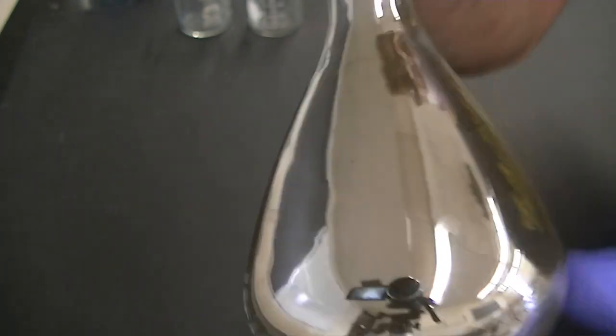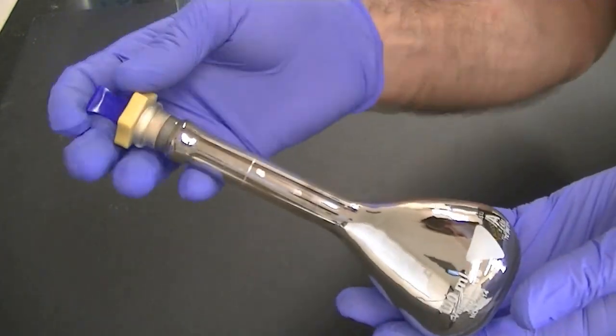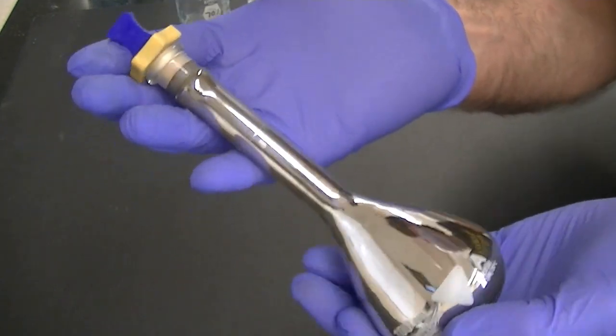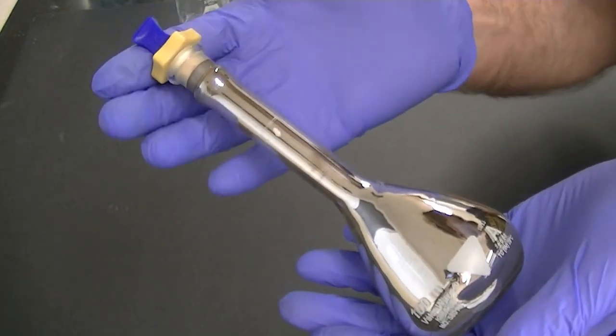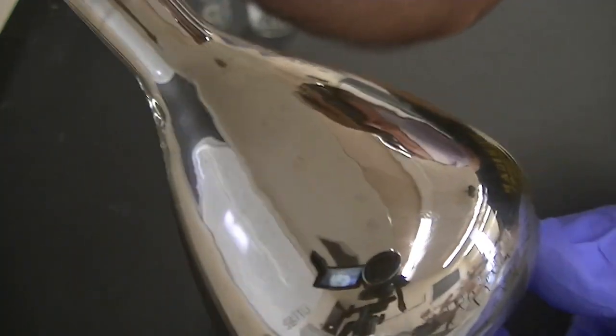I'm glad that none of the other ingredients in the Powerade inhibited the formation of the mirror. I wonder if this would work with orange juice. Do you have ideas for other sugar juices to try to form a silver mirror? If you do, please leave your suggestions in the comments. And thanks so much for watching!